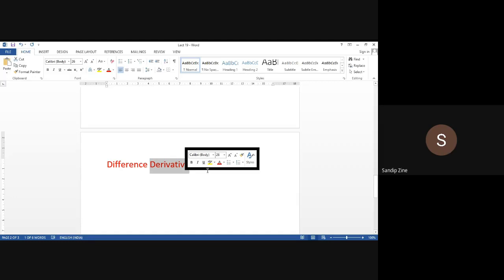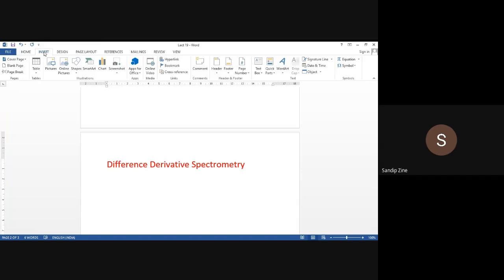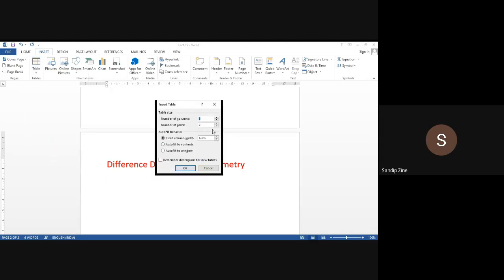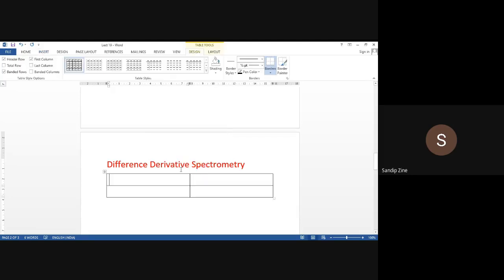Can anybody talk? Or maybe you can compare with normal colorimetric or UV spectroscopic analysis. We have done experiments in a previous session, colorimetric estimation of salicylic acid, or maybe we did an assay of various tablets.